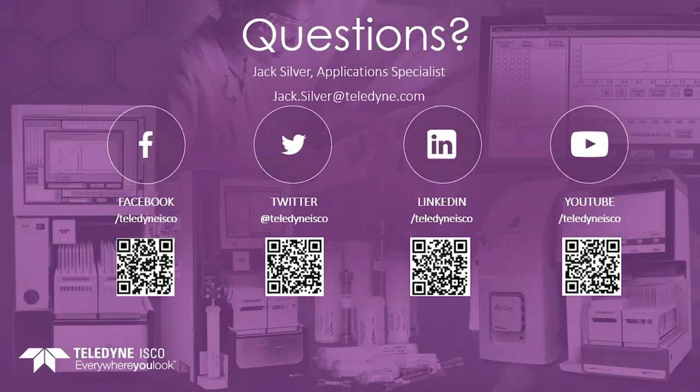Okay, another question is, what is the minimum volume that can be injected with the AutoSampler? We say that we can inject 100 microliters, and that's what we can inject very easily. However, we've injected down as little as 10 microliters very successfully, and we do it pretty commonly. If you want to inject that sort of volume reliably, you have to make sure that the fill station on the AutoSampler is filled up.